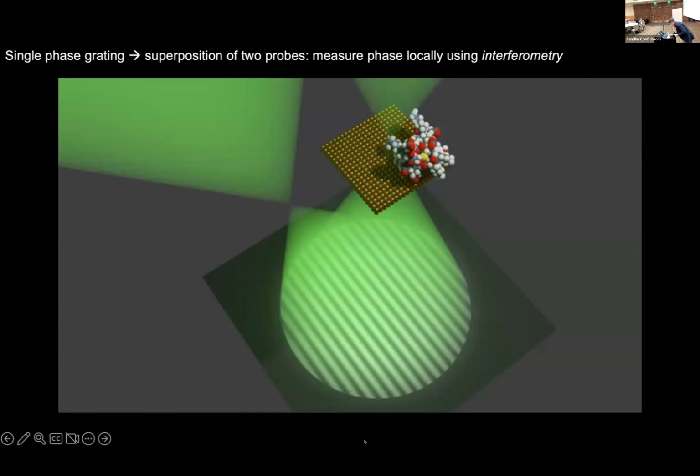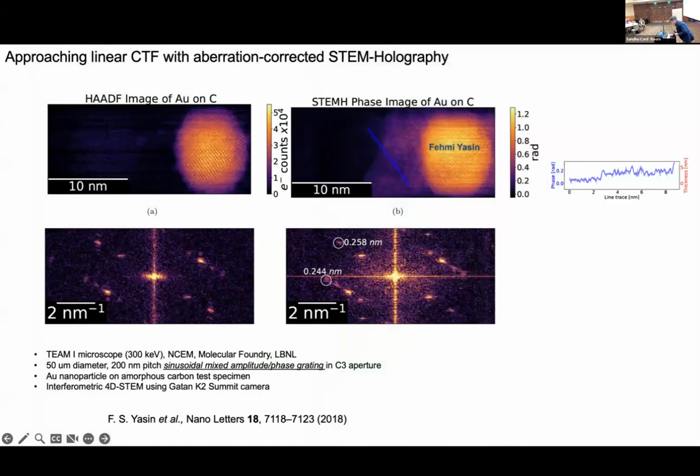So here's a gold nanoparticle suspended on an amorphous, very, very thin carbon substrate. You can see these lattice fringes, so we're actually looking at the atomic planes within the gold. And in the normal imaging mode, you can't see much else, which is the point. Usually, if you've got a microscope slide, you don't want to see the glass. Here, the glass is amorphous carbon.